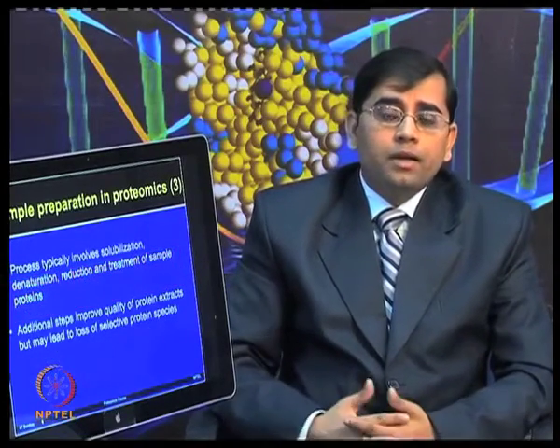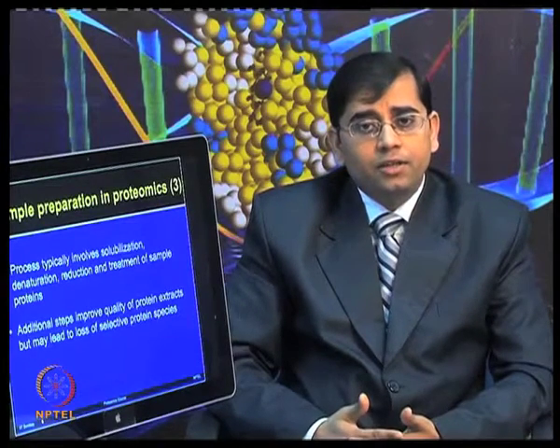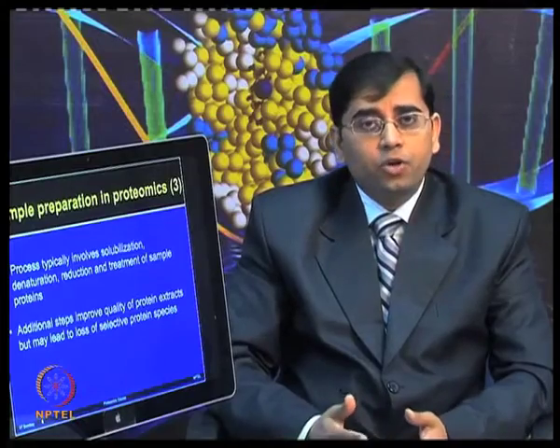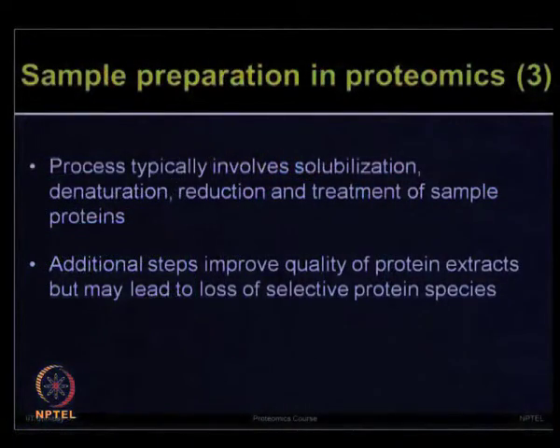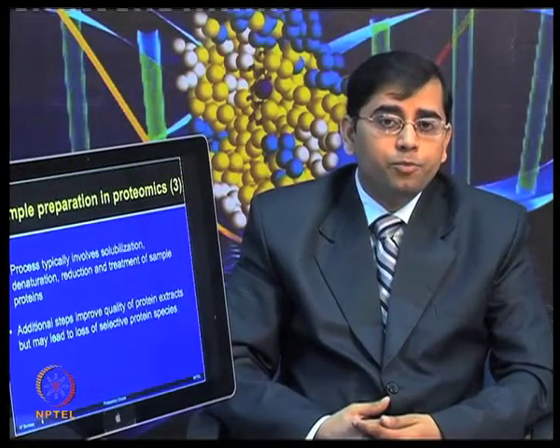Now, all of this sample processing involves solubilization, denaturation, reduction and treatment of sample proteins, but you need to involve additional steps depending upon the type of samples and your objective, so that the protein quality, the protein extract, can be improved.